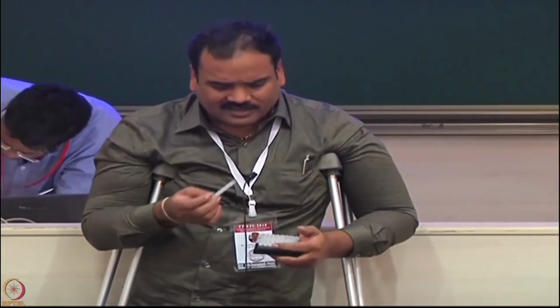Here we have already mixed the DNA aptamer and the ATP. What I'm going to do now is dip the glass capillary and load it. Once you load it, within 10 minutes you can do it. Normally proteins are very unstable at room temperature, so the DNA has been used. The DNA is very stable here. Generally for demos, I prefer to do it with DNA because it's more stable. You can carry it anywhere you want.